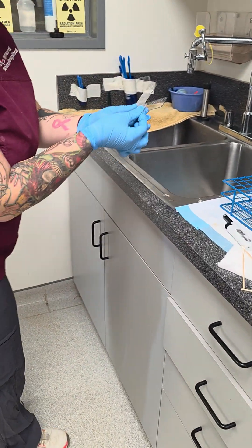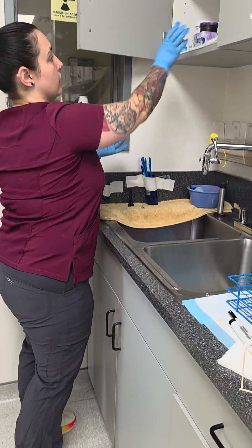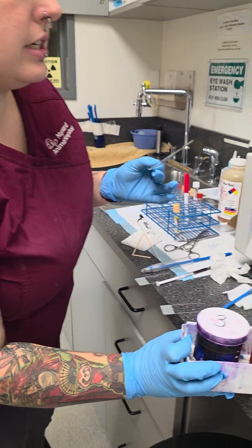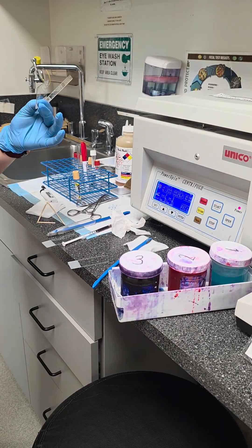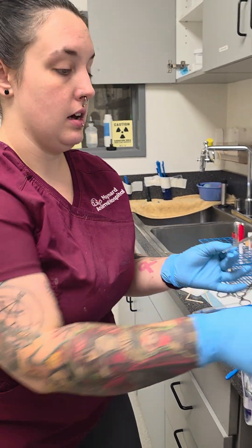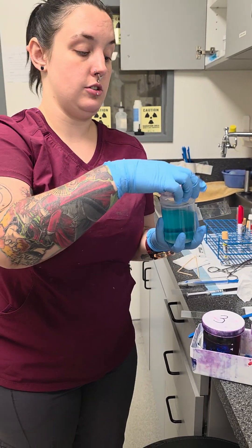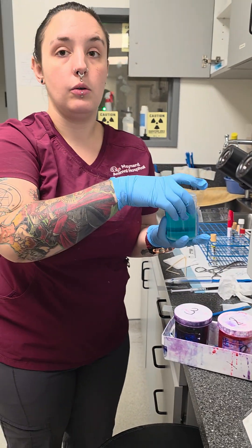So from here we're going to go get our cytology. This is a dirty cytology. For clean cytologies we do blood or FNAs. For dirty: fecal, ear cytology. Just think anything gross, we're putting it in dirty.